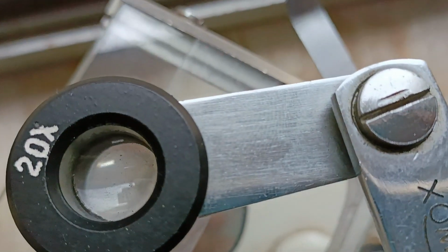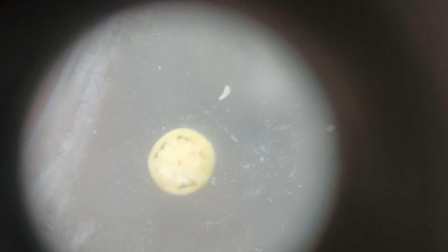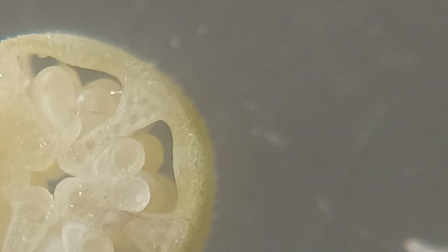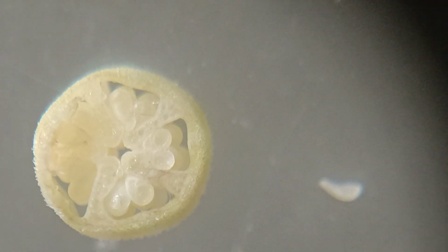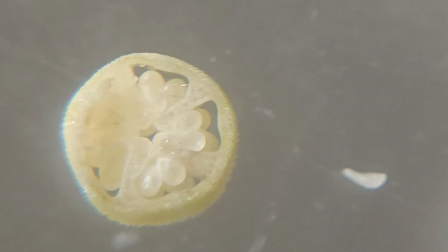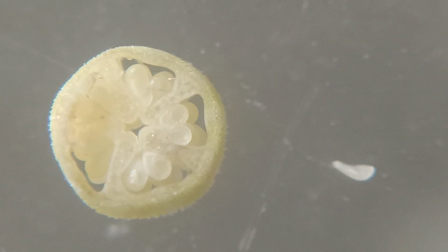Ovule, a plant structure that develops into a seed when fertilized. A mature ovule consists of the nutritive tissues covered by 1 or 2 future seed coats known as integuments. A small opening called micropyle in integuments permits the pollen tube to enter and discharge its sperm nuclei into the embryo sac. Each ovule is attached by its base to the stalk or funiculus that bears it.